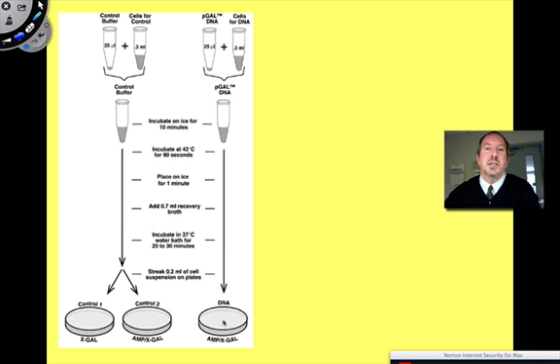And so we want to put two genes into them. And the way we're going to do that in the experiment is, I'm just going to run through this fairly quickly. It'll be obvious when we're actually doing it. But the way we do this is simply take the E. coli, we add a plasmid that contains those two genes to it. We simply pipette that in there. We incubate it, which means just let it sit in a little ice bath for about 10 minutes, which chills them. We believe that the ice kind of slows their cell membrane down, and then we heat shock them. We take them from that cold and put them into a 42, which is pretty hot, almost lethal, and we're going to heat shock them for 90 seconds and then back on ice.